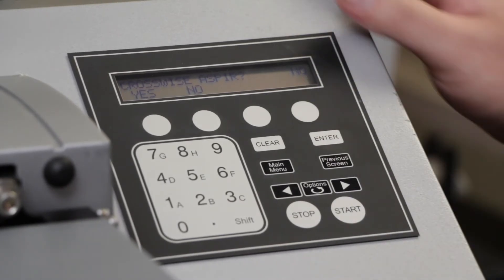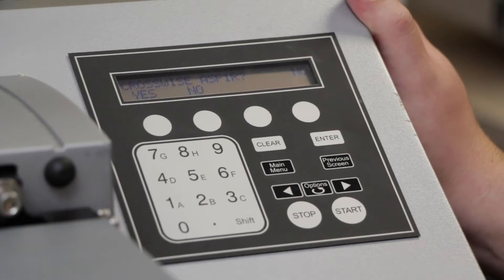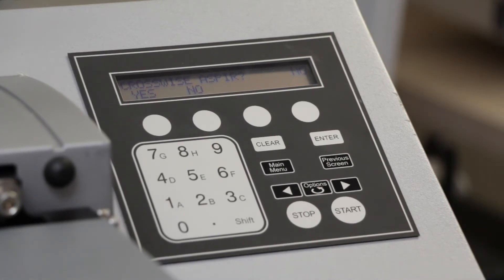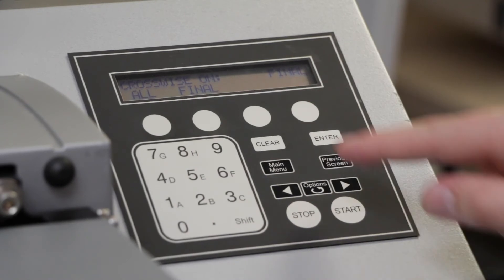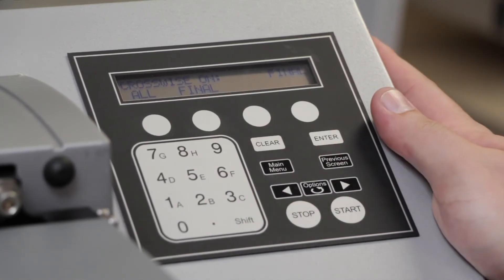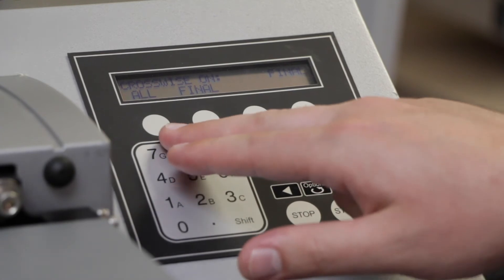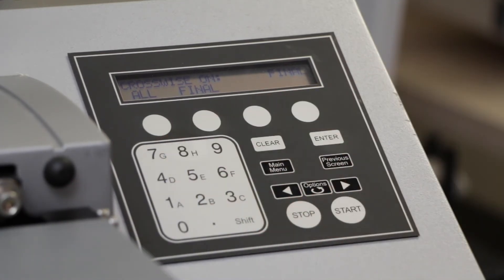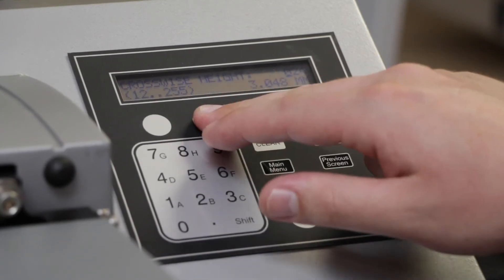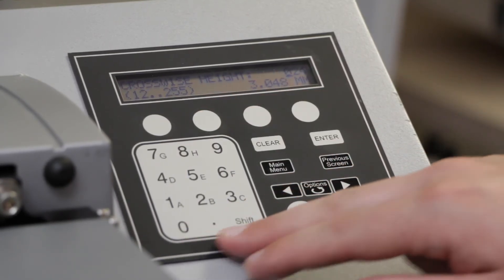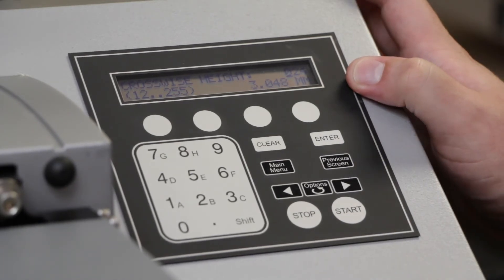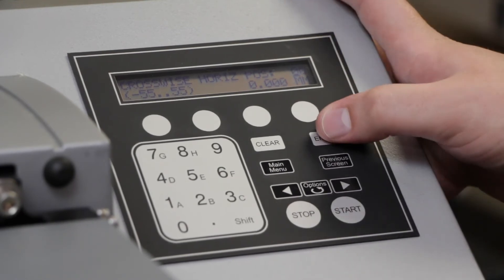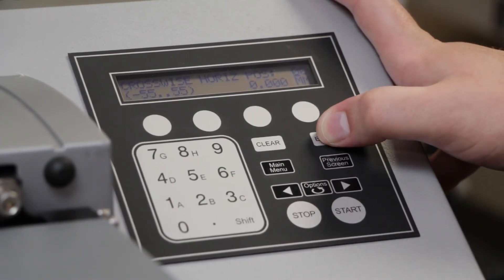A crosswise aspirate will allow you to aspirate at a second location in your wells. In our situation, we adjusted to the positive X and Y, so for our crosswise that we are going to utilize, we'll go to the 0 position. Our crosswise is only going to be on the final aspirate. You can also select the option to do every aspirate. This will depend on how many cycles are in your wash protocol. We'll leave our height at a higher value of 24 steps or 3.048 millimeters, and we'll use our 0, 0, X, and Y position for the carrier.